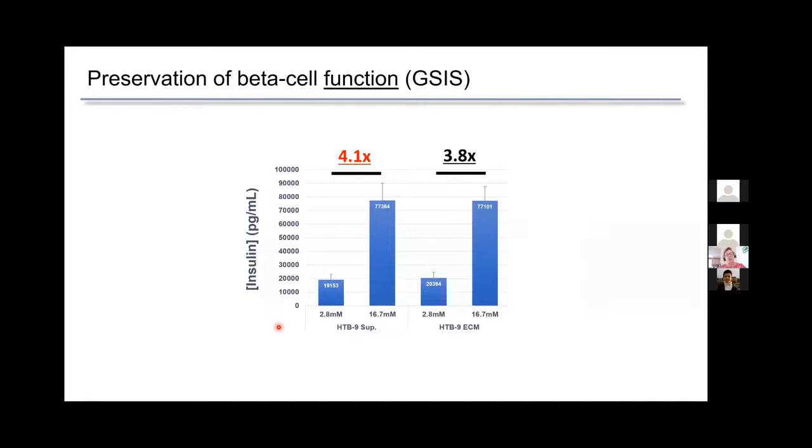We can culture these cells also up to, I think we've gotten to 2 weeks so far. We don't really need more than that, but I imagine you could test the limits and see if you could keep them growing even longer. I think really the limit becomes the overgrowth of non-endocrine cell types in the culture.